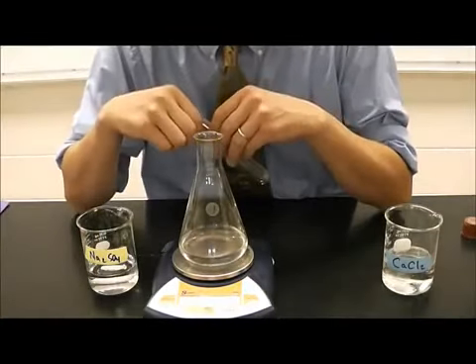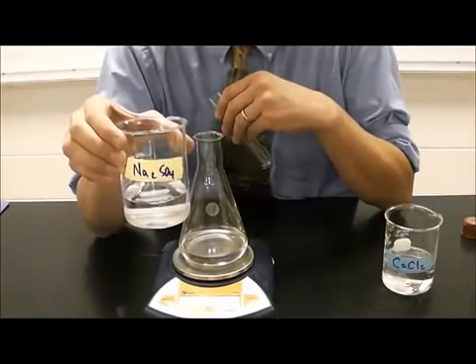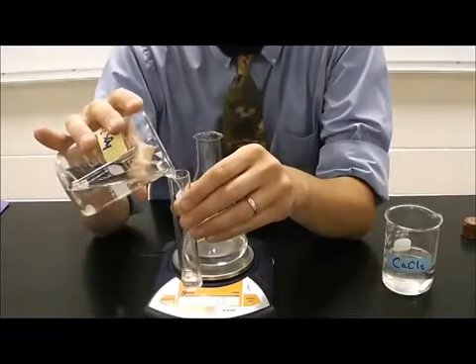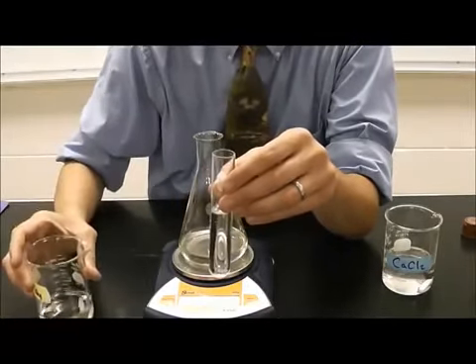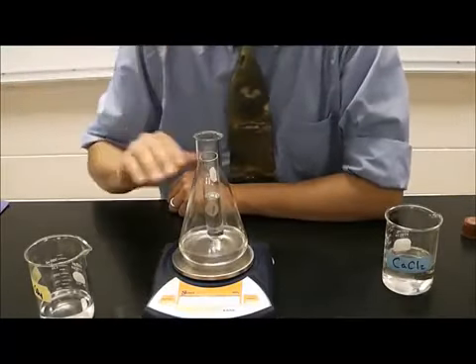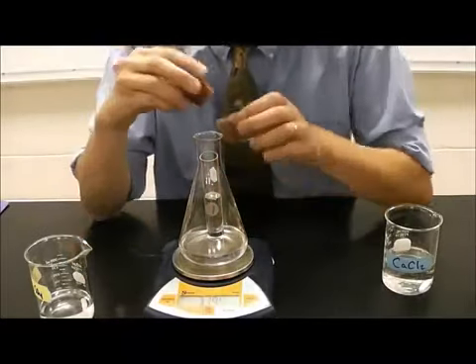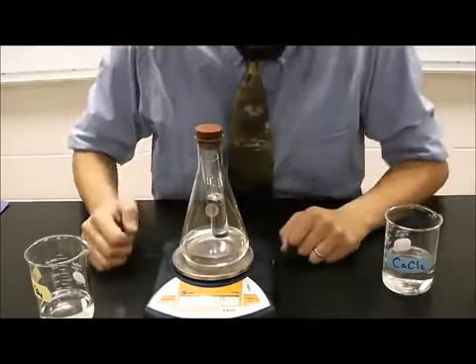In order to have a chemical reaction, we need two chemicals, so I am also going to add some sodium sulfate. I'm going to add it in this test tube. About half full should be good enough. Okay. So I'm going to place the test tube inside the Erlenmeyer flask. Notice that the two chemicals are not mixing yet. I'm also going to use a stopper to stop up the top of the Erlenmeyer.